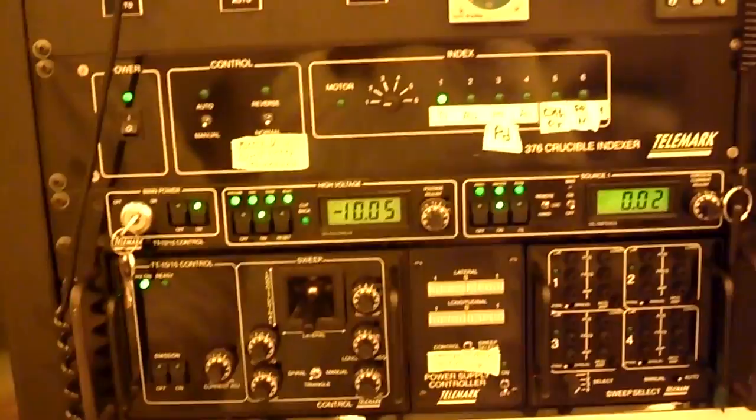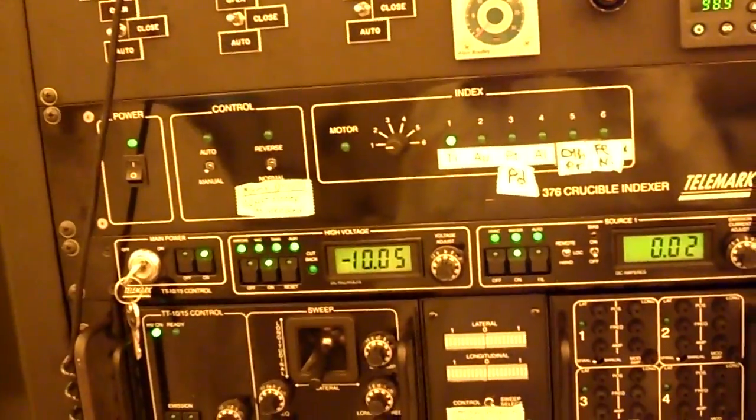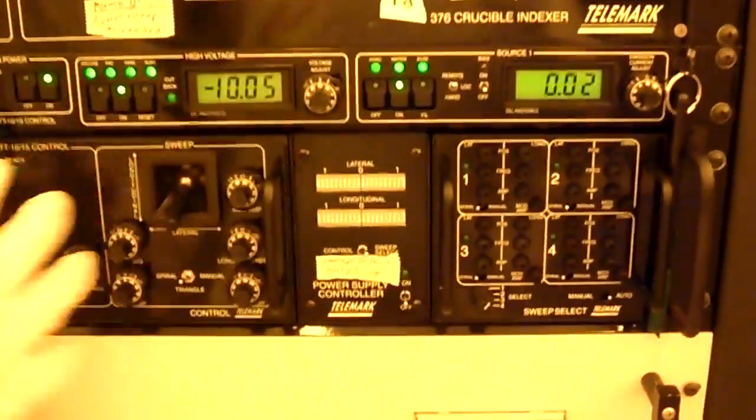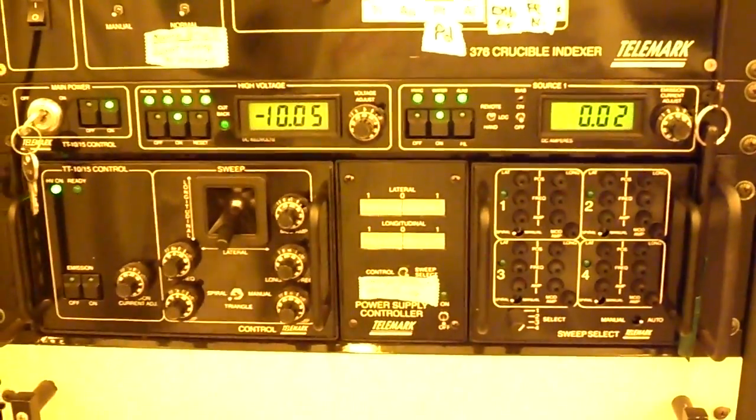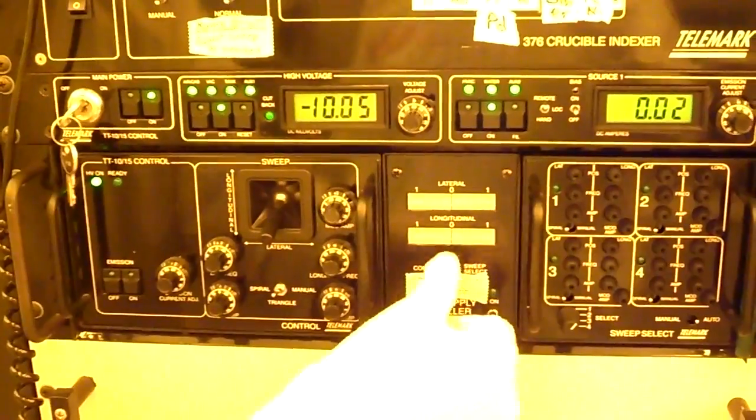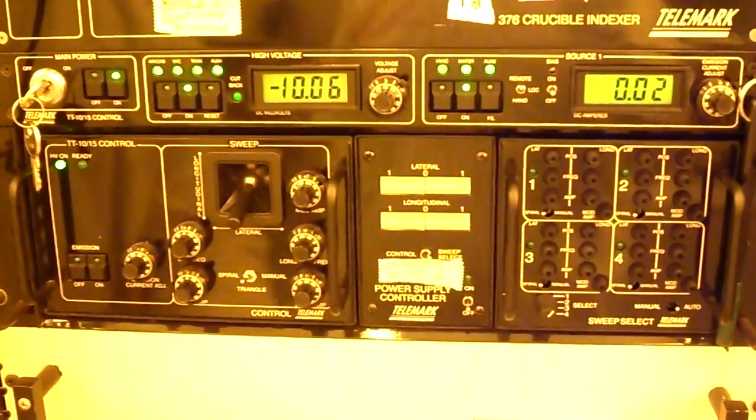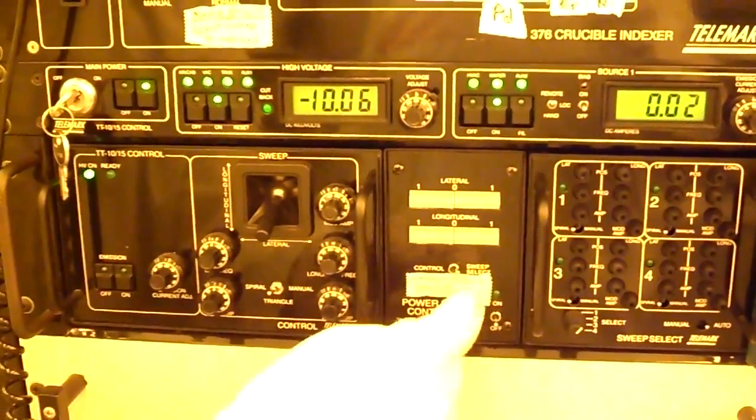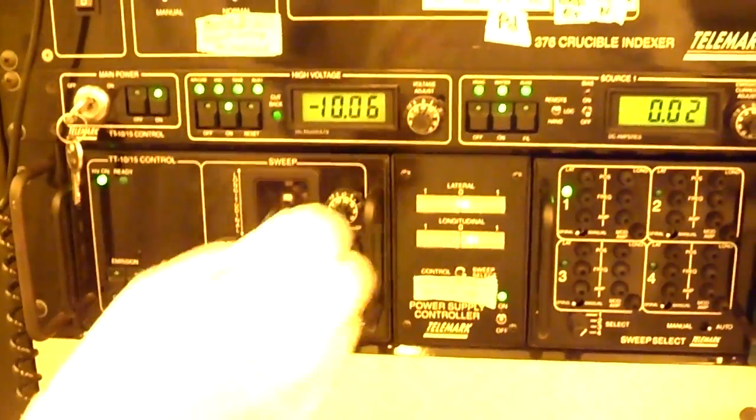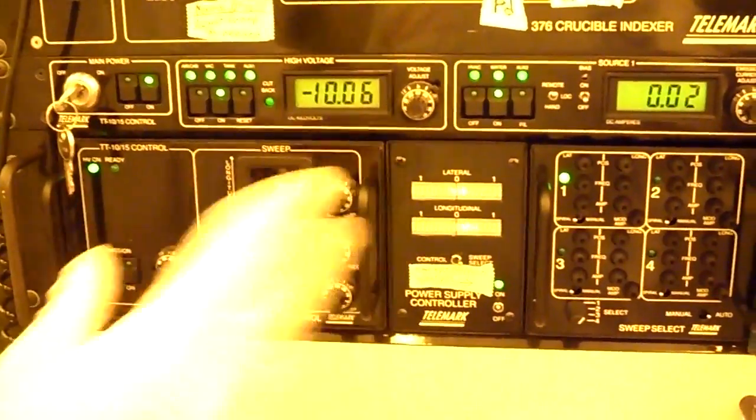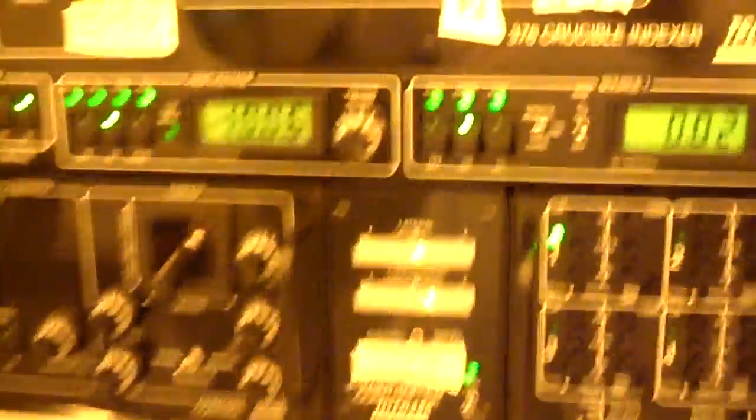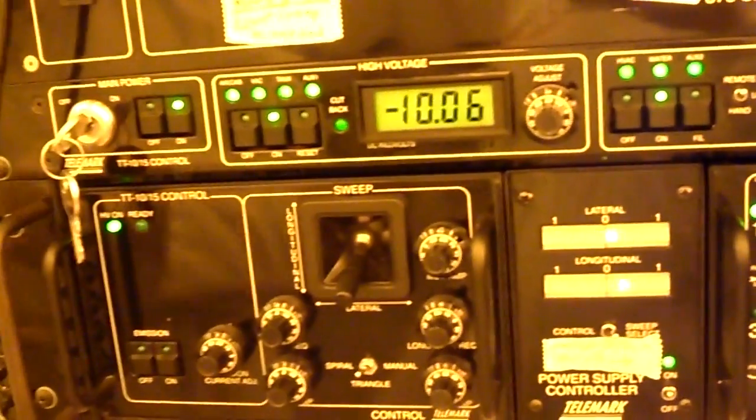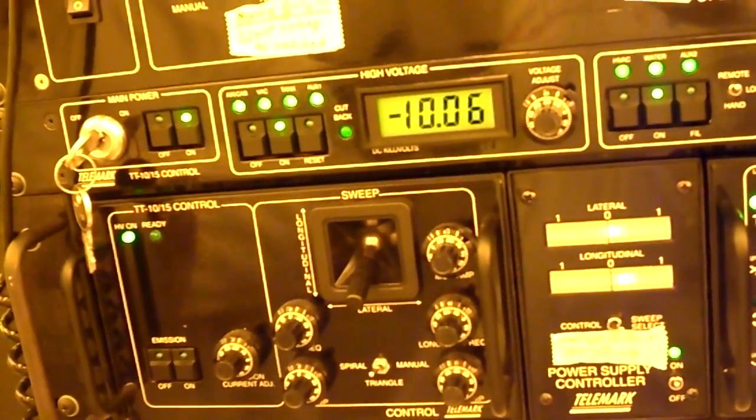So we've got high voltage. We haven't actually turned the power up yet. The other thing we have to do, though, is you see the sweep control area here? We want to turn that on. It should be in spiral mode. It should be in sweep select mode. It should be in spiral mode. So that's proper. You see sweep select only. Turn that on and you'll see there's some oscillations. What that is is you don't want it in one spot. You want to try to heat a broad area of your source. And so this sweeps in some kind of oscillating spiral pattern based on the parameters we've given it. We'll adjust it a little bit today to see how it works.